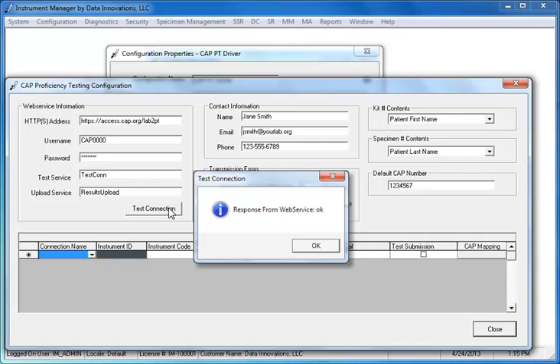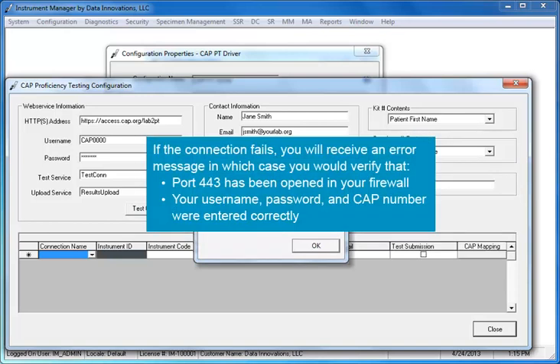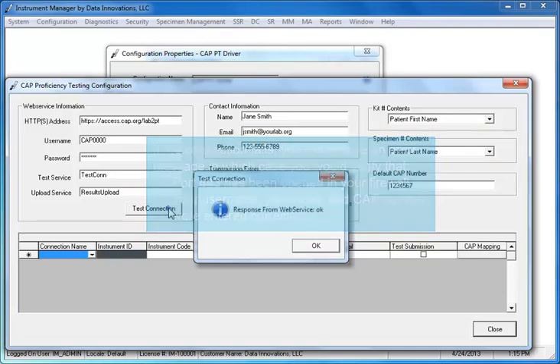If the connection fails, you will receive an error message, in which case you would verify that port 443 has been opened in your firewall and that your username, password, and CAP number were entered correctly.